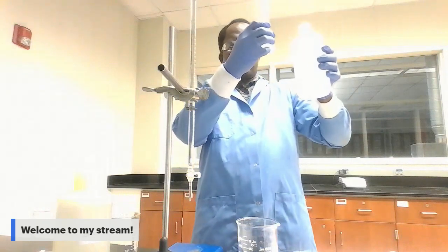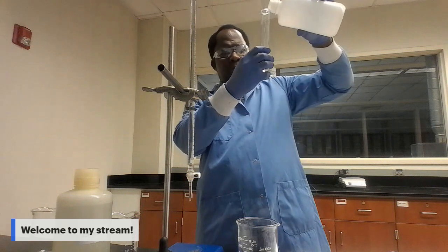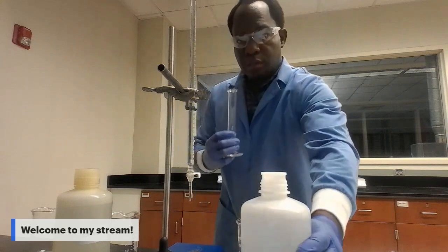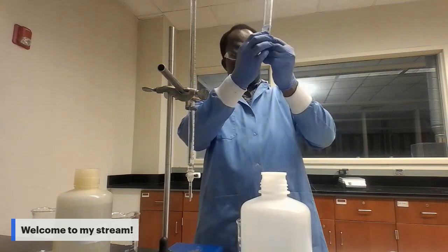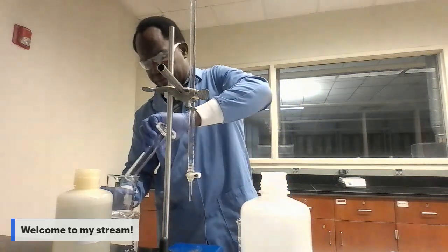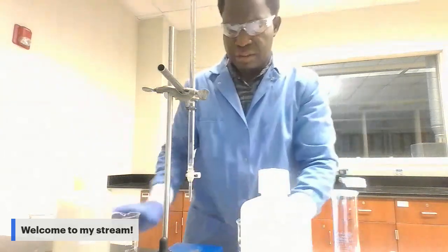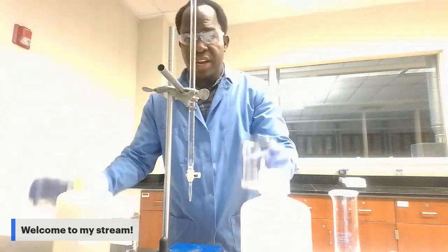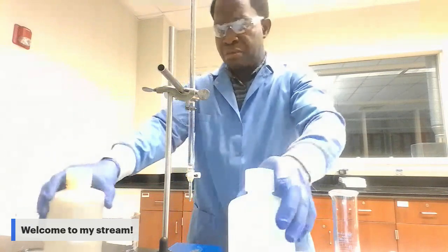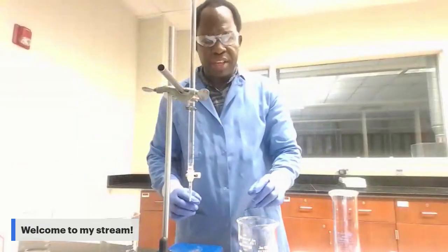Then pour another into my third beaker. Now I have my three beakers filled with 20 milliliters of Ca(OH)2. Let me move those solutions to the side so you can clearly see what is happening here.